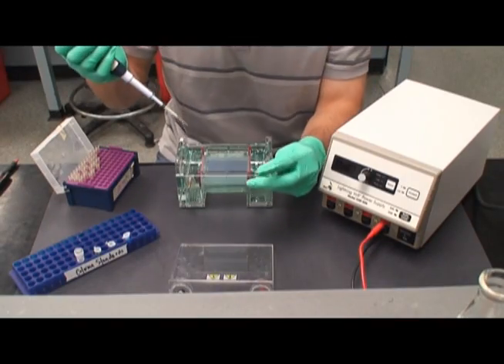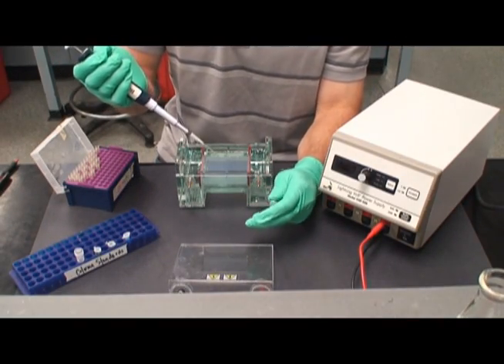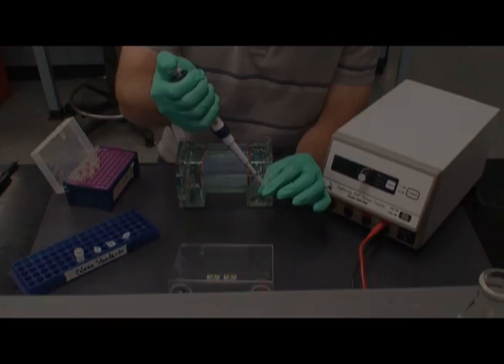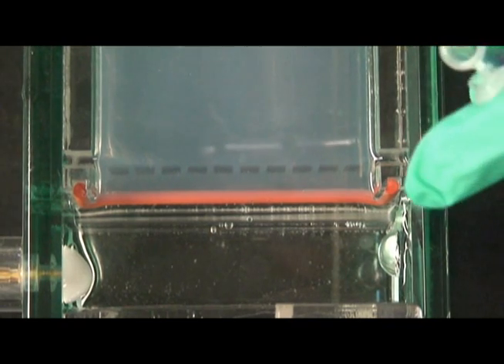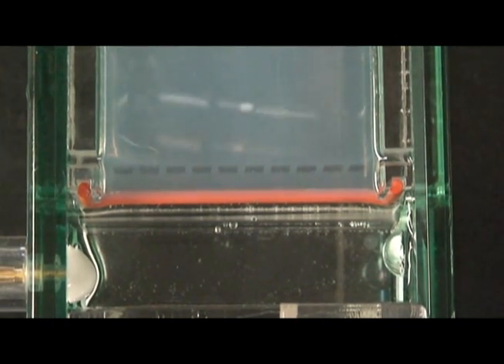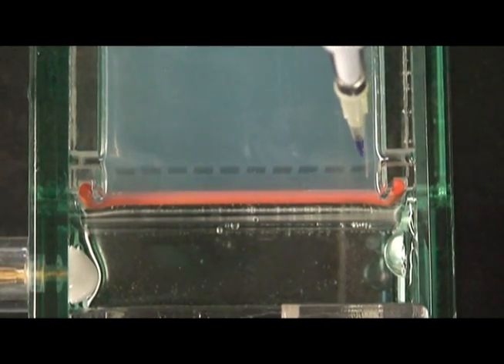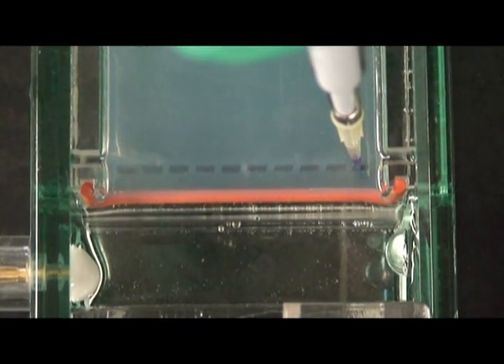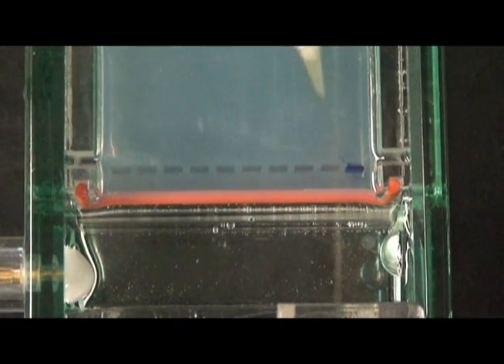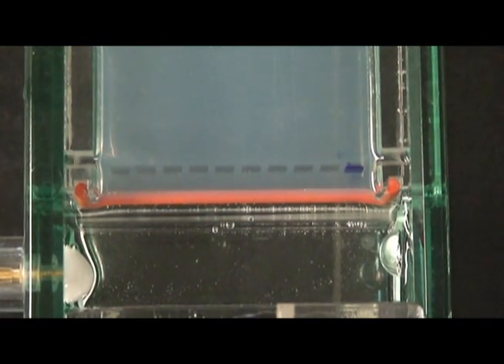With the wells appropriately positioned, carefully pipette 20 microliters of the desired sample into each well. When loading a well, make sure to insert the pipette tip slowly as to not puncture the gel. After slowly expelling the sample, keep the micropipette plunger depressed until the tip is removed. Otherwise, the sample will be sucked back into the tip.